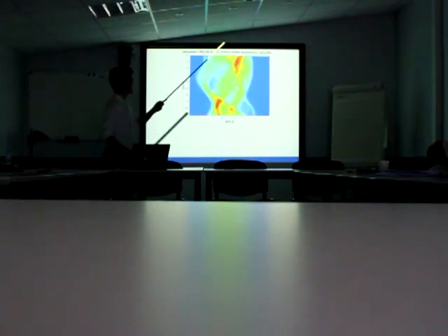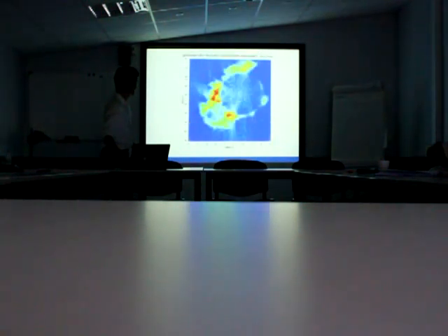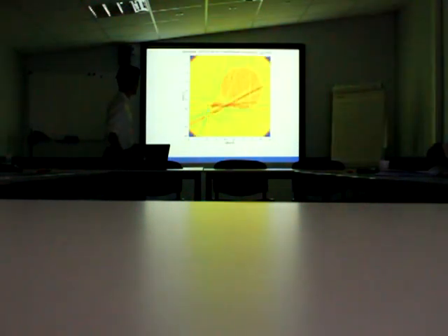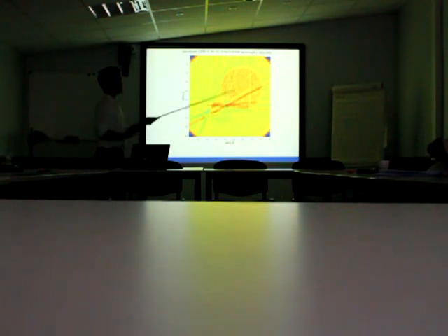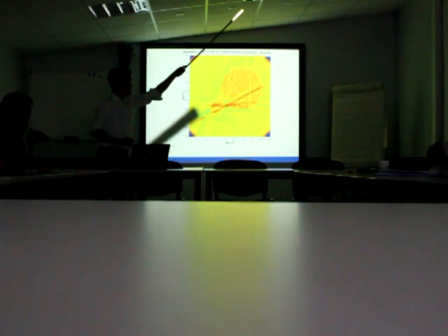This is screenshots from Dioptas. And they're reconstructed from the corrected sinogram. It's not much difference for this phase, but here you can see for glass spheres you have lots of artifacts. You have some nice streaks originating from this position.